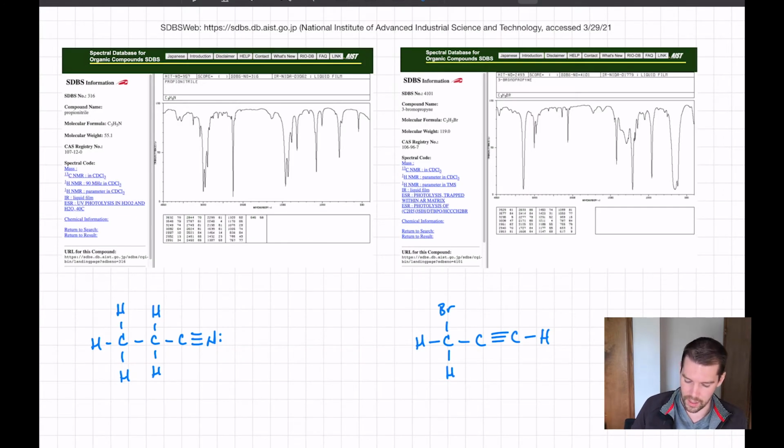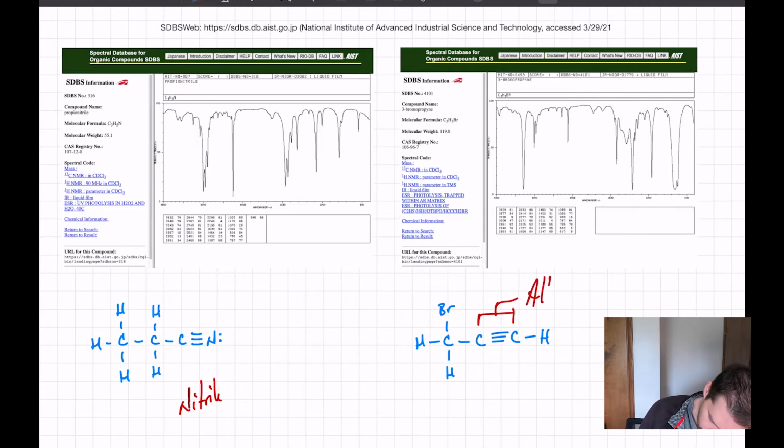Okay, so for our last group here, what I wanted to highlight was this right here. We have a triple bond, carbon-carbon triple bond, and a carbon-nitrogen triple bond. So this we know is a nitrile. This is an alkyne. So I'll just write that down, nitrile. And this is an alkyne, Y-N-E. And this bond right here, that would be an sp-CH bond. This carbon is sp hybridized.